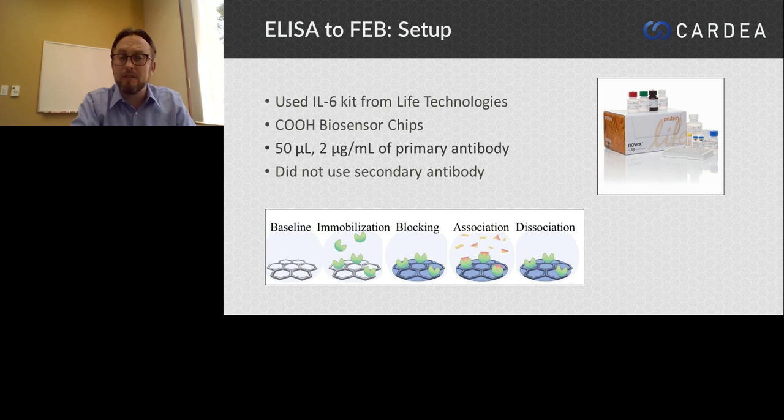We took an ELISA for IL-6, which is an inflammation biomarker. It's used in a lot of different tests. We took that kit from Life Technologies, just a standard kit for IL-6 detection. We attached the antibody from that kit that binds IL-6 to our chips.